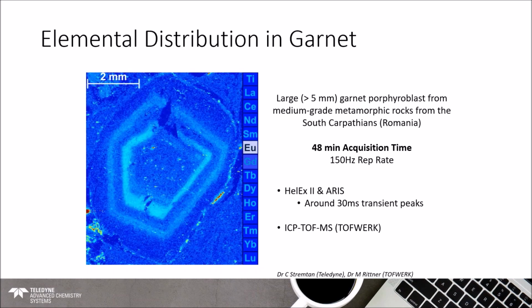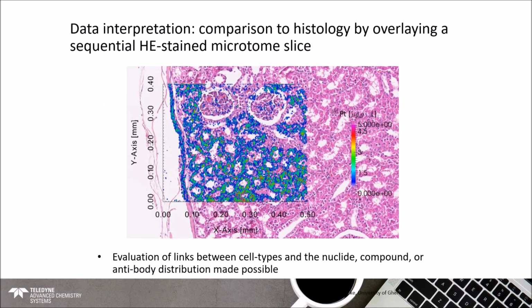Okay. The last example that I want to show then is of a stain that was analyzed, with the elemental data overlay. One of our softwares that we utilize called HDIP allows for the import of imagery from different sources. So you can import SEM data or X-ray data if you'd like. Stains like this could be imported.